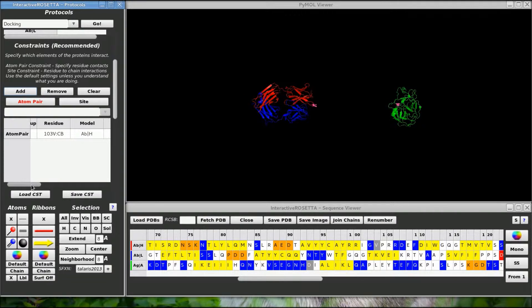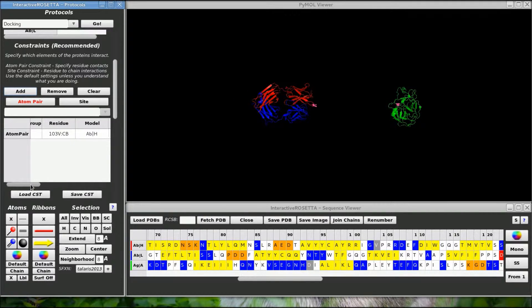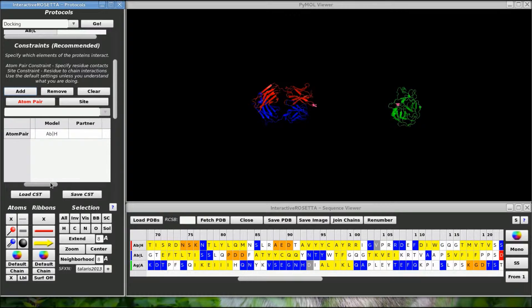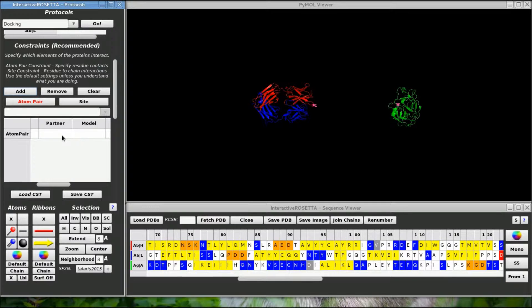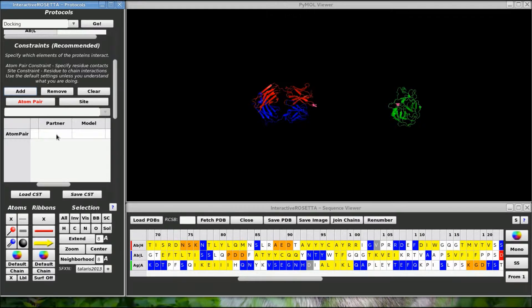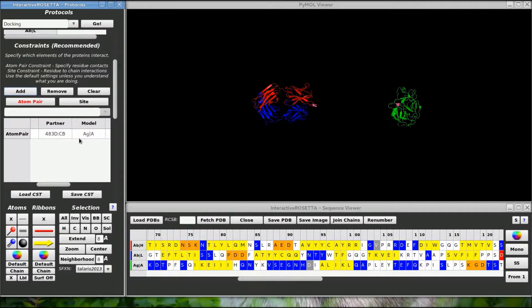Then I come over here and select atom pair and add them to my constraints set. But we are not done yet. When I add the constraint it only is aware of the first residue in the pair, which is in the static chain group, in this case from the antibody. So the partner field is left blank. Since I have the right partner already selected all I have to do is right click in this cell to get the partner to show up.